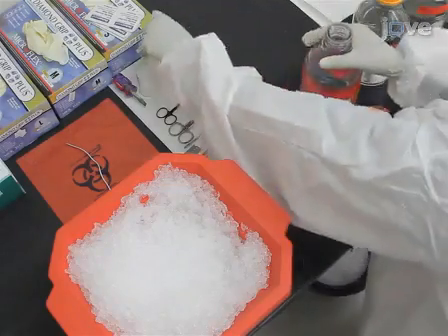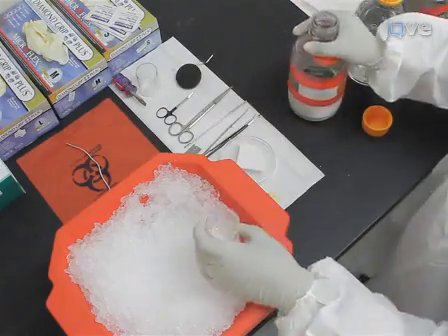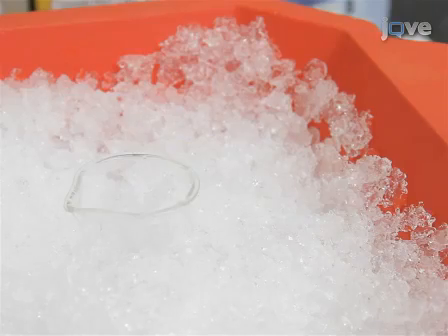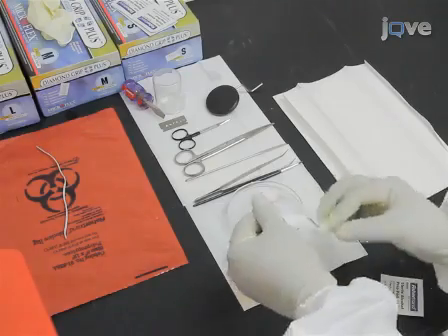Next, transfer 10 milliliters of sucrose ACSF into a small beaker and place it in an ice bucket. Then, place the instant Loctite adhesive in an ice bucket. After that, prepare a razor blade and the necessary tools.